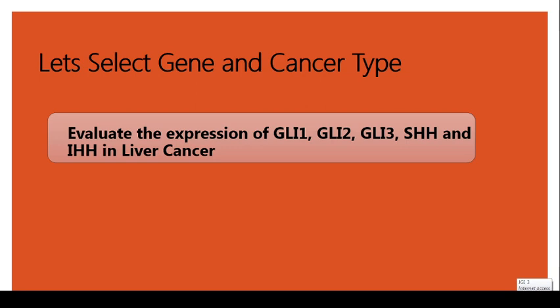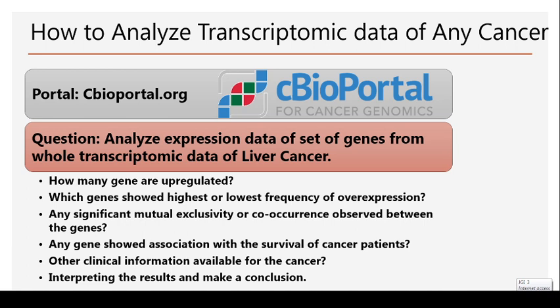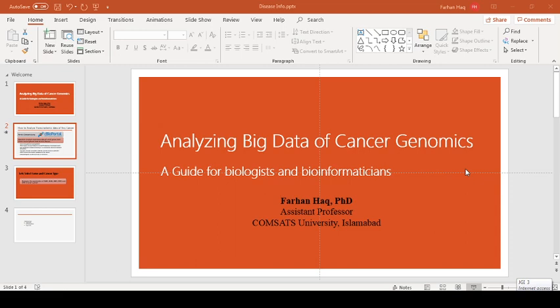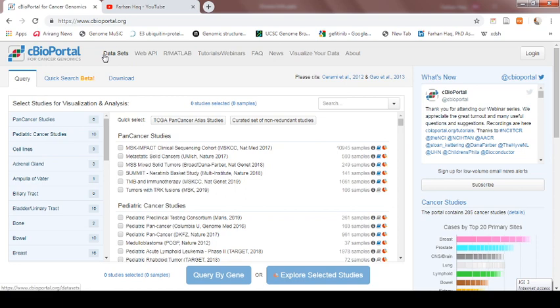So let us select a gene in a cancer type. The question is: evaluate the expression of Gli1, Gli2, Gli3, SHH, and IHH in liver cancer. First of all, if we want to evaluate the expression, we need to find a cancer type dataset — that is liver cancer — then download the expression information in a graphical or tabular format, and then perform the analysis to evaluate which gene showed overexpression, which showed the highest expression, and which showed the lowest frequency of expression. So let us go to cBioPortal.